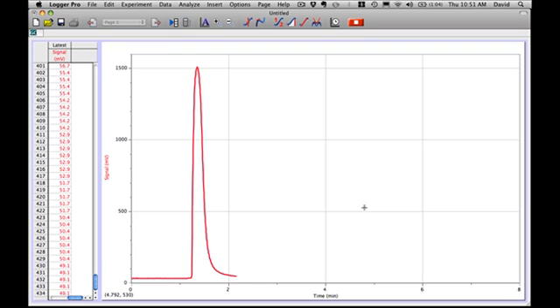And we will let this gas chromatogram develop and come back to you in a moment to look at our final plot and the data analysis.